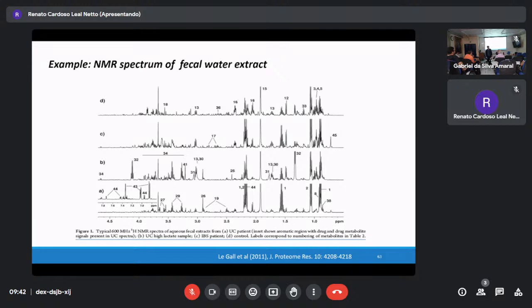So if you do snake venom metabolomics, actually metabolomics doesn't make any sense, unless you are interested in what kind of metabolites are there regardless of the protein. But spider venom is a small molecule, so you can treat it like CSF. But the snake venom case interested me, so I just measured it without any precipitation.